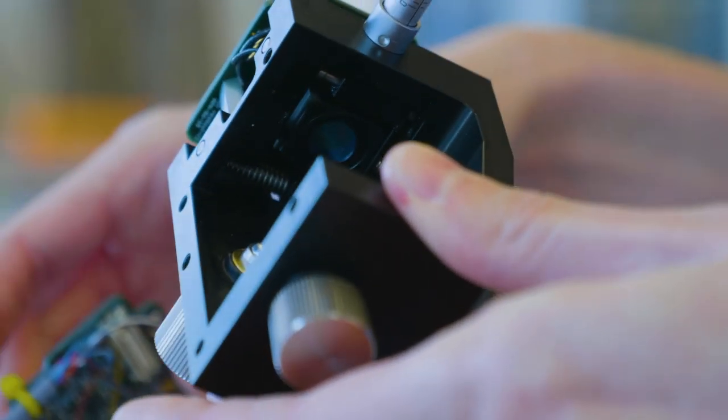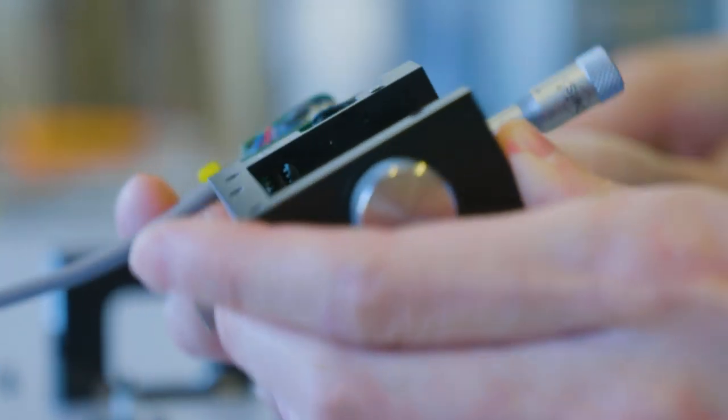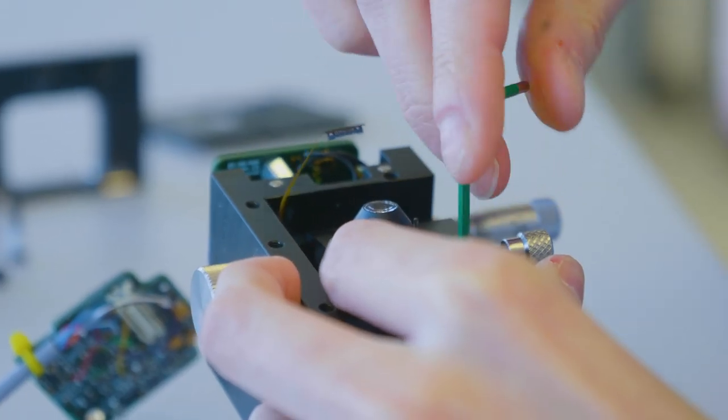We have three different types of workshops. They all are part of this AFM technology but involve different components of the system. The main workshop that we host is based on the atomic force microscope head—this is essentially the heart of the instrument.